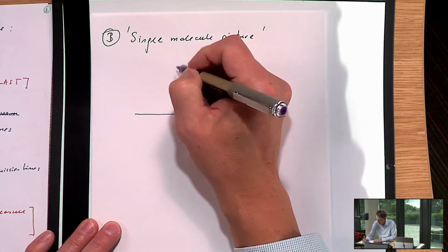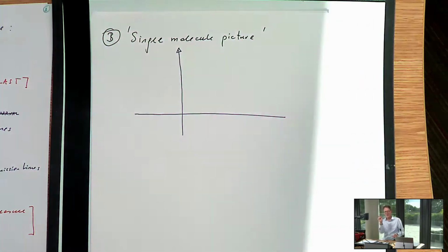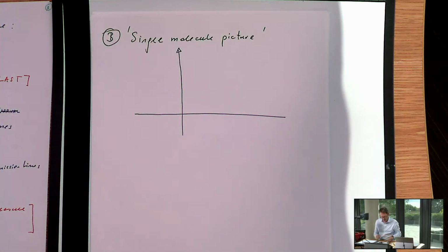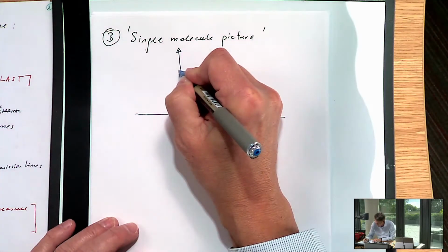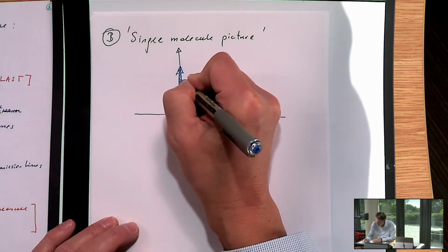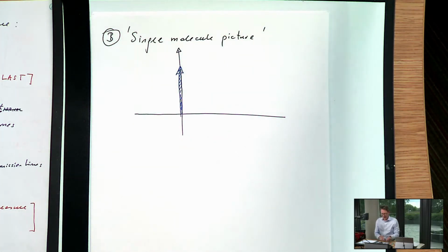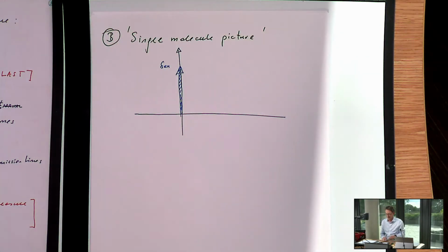Let's, for a single molecule, make the excitation pulse very, very short. So if we make this very, very small rectangle, then in fact this starts to approximate a delta function at t equals 0. And what happens? So we have this very sharp pulse of light. So we call this delta Ex for this discussion here.